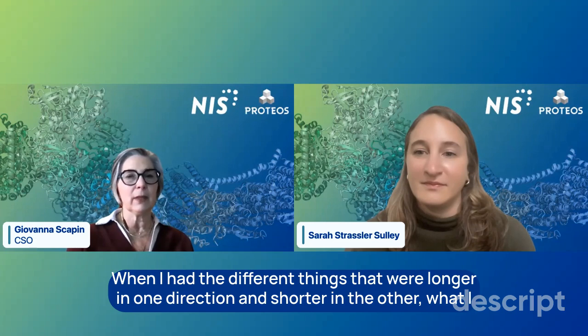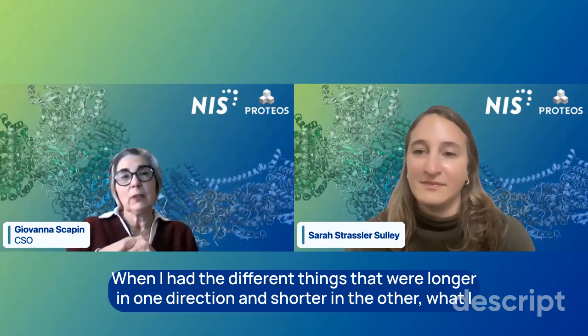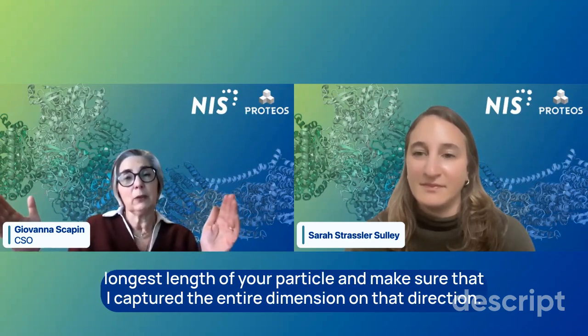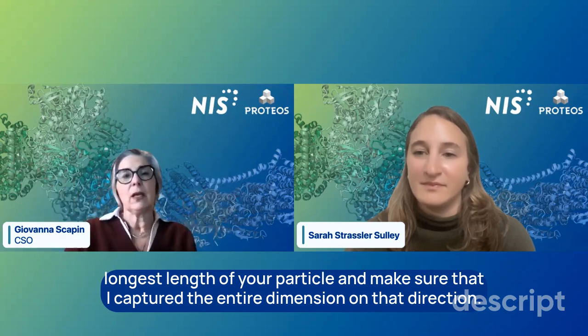When I had different things that were longer in one direction and shorter in the other, what I always try to do is to get my box big enough to cover the longest length of the particle and make sure that I capture the entire dimension in that direction.